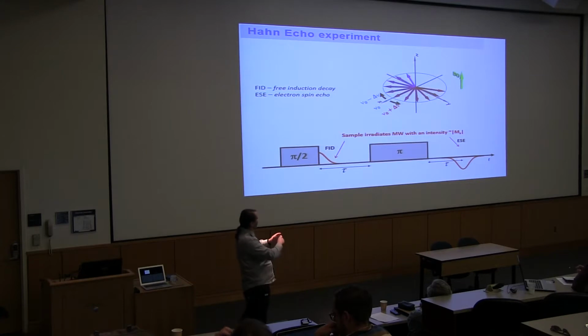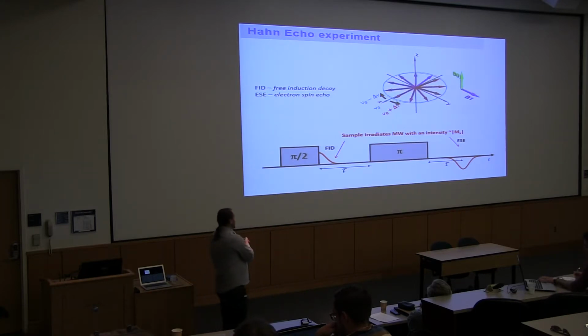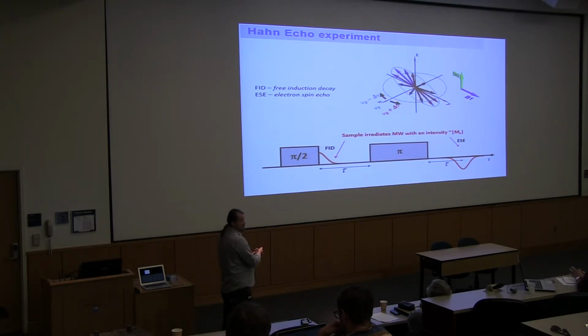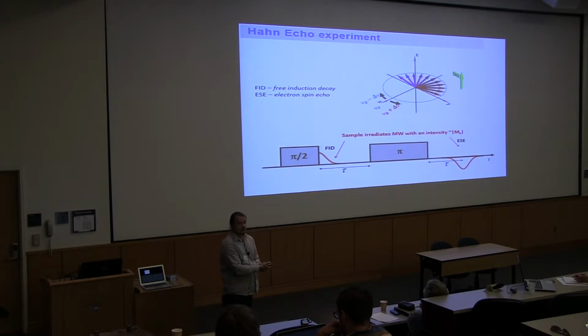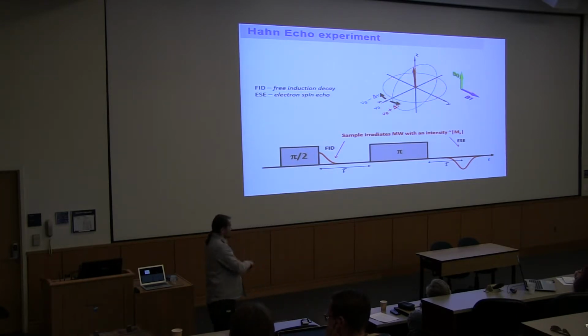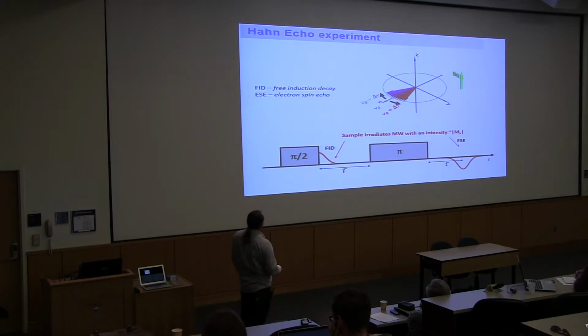But basically, that's the whole principle of pulse EPR. We're taking our system out of equilibrium, we perturb it, and then we observe what happens here. And I can tell you that one of the methods is when you utilize directly this pulse sequence, called a two-pulse ESEEM experiment. And if we change the length of the delay between the two pulses, nuclear spins will perturb things a little bit differently, so you'll see a modulation in the electron spin echo. But this is as far as I want to go with this, all right? Because there's something more important to talk about, and that's what we're actually getting out of those experiments.